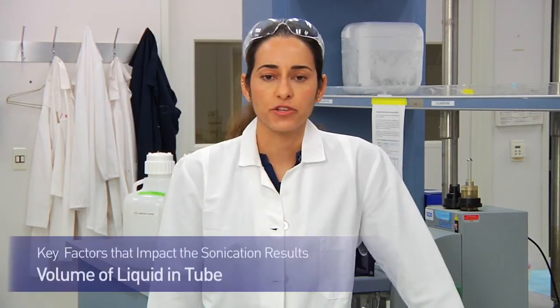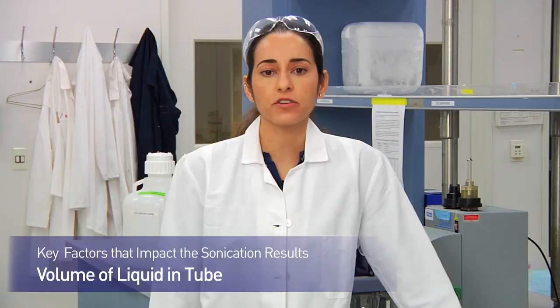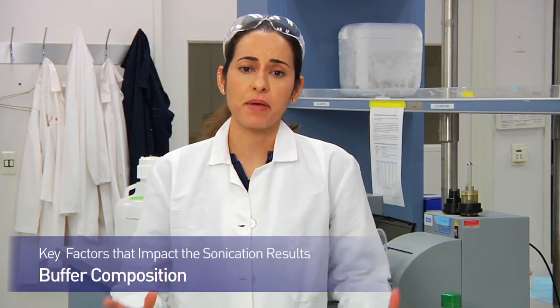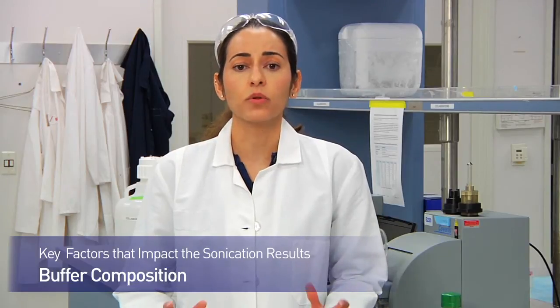Volume of liquid in your tube is also a factor. If you change the volume of liquid in your tube, you should confirm that your sonication results are the same, as volume can introduce variations in fragment size. Buffer composition is a big one — the type and concentration of detergents in your lysate buffer will definitely change your fragment size, so if you make any adjustments to your buffer, be sure to re-optimize your sonication parameters.